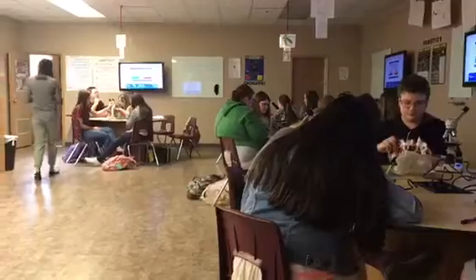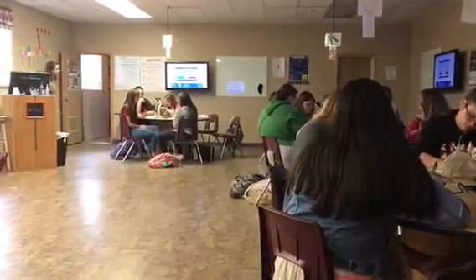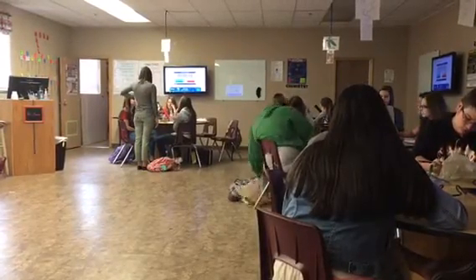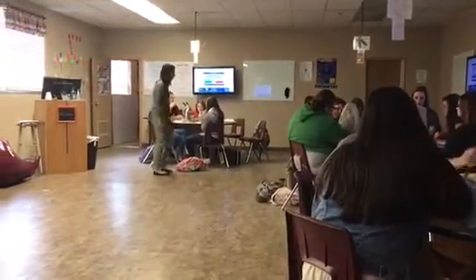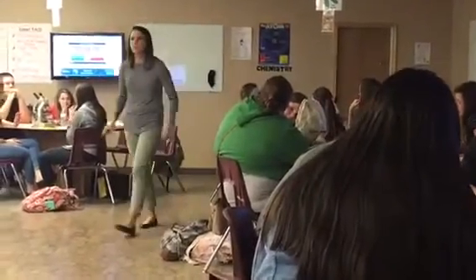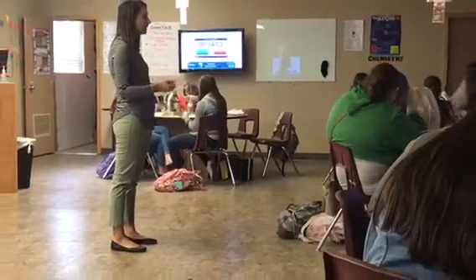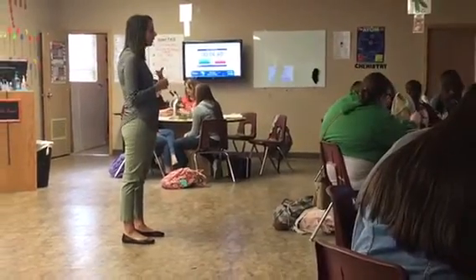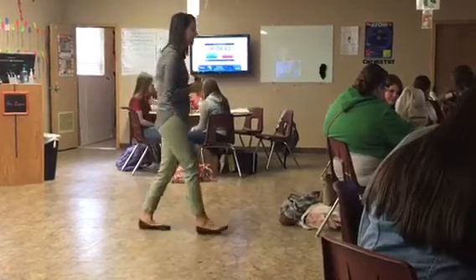Alright, you got about 5 more minutes. Yes. Hey, if you're finished with your microscopes, use the coarse adjustment, put the stage all the way down, put it on the lowest objective, put your cover on it, unplug it, and turn the light off. Okay?